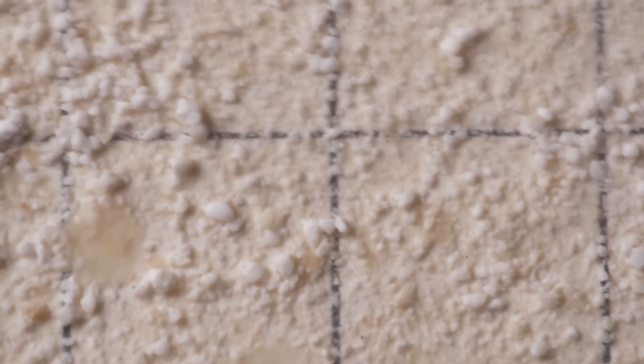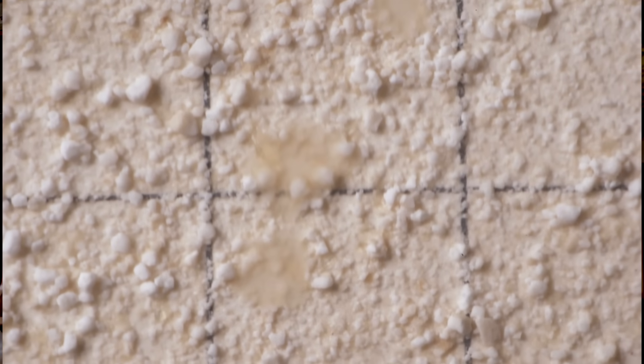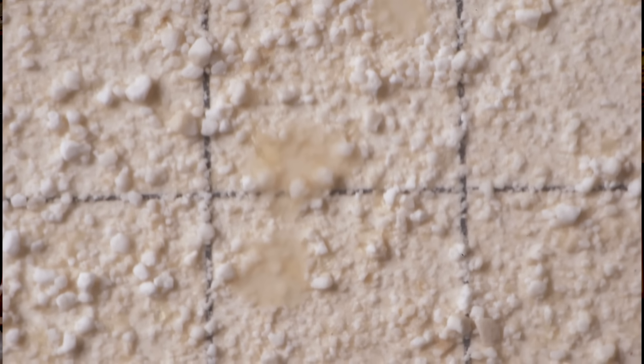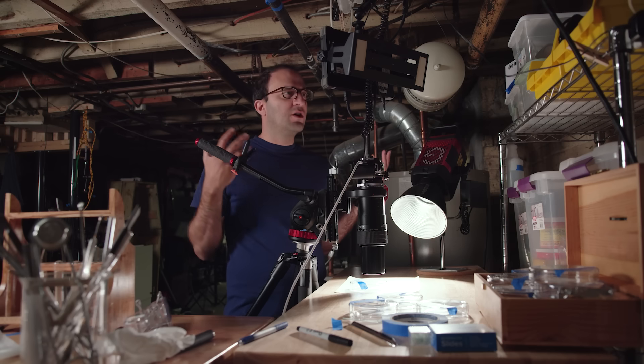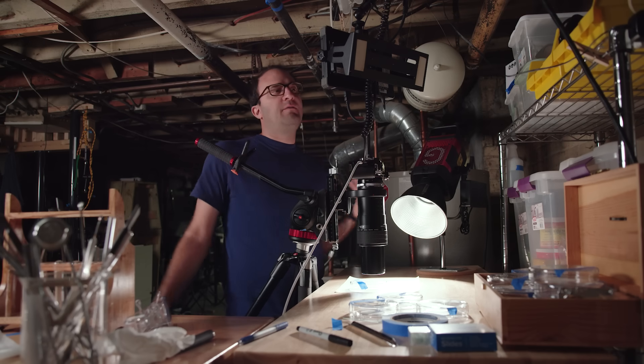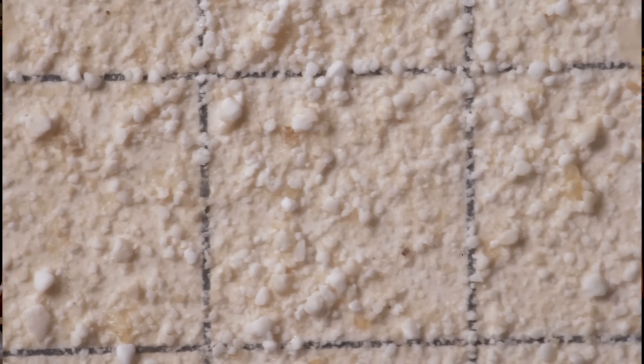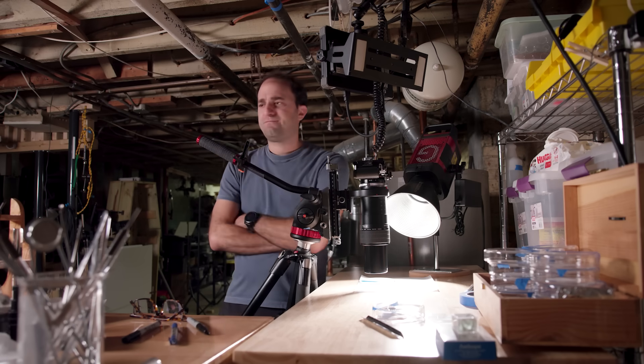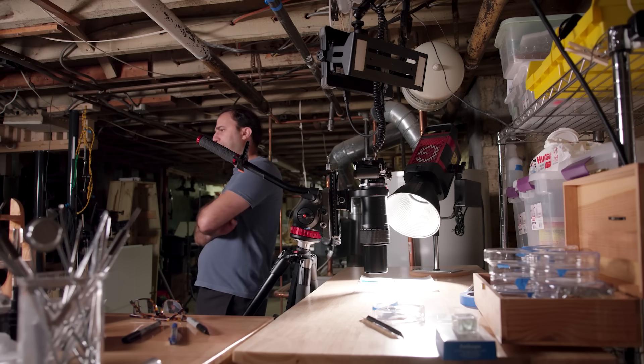The thing about the Simply Gum sample was it looked totally different. It's not clear to me that this is plastic. The big chunks are way bigger than the other pieces I've seen, and to me this looks a little bit like sugar. Maybe there's just not enough water to dissolve the sugar, and so I'm getting a bunch of sugar out. At this point, the Simply Gum has thrown me for a loop — I am completely confused.